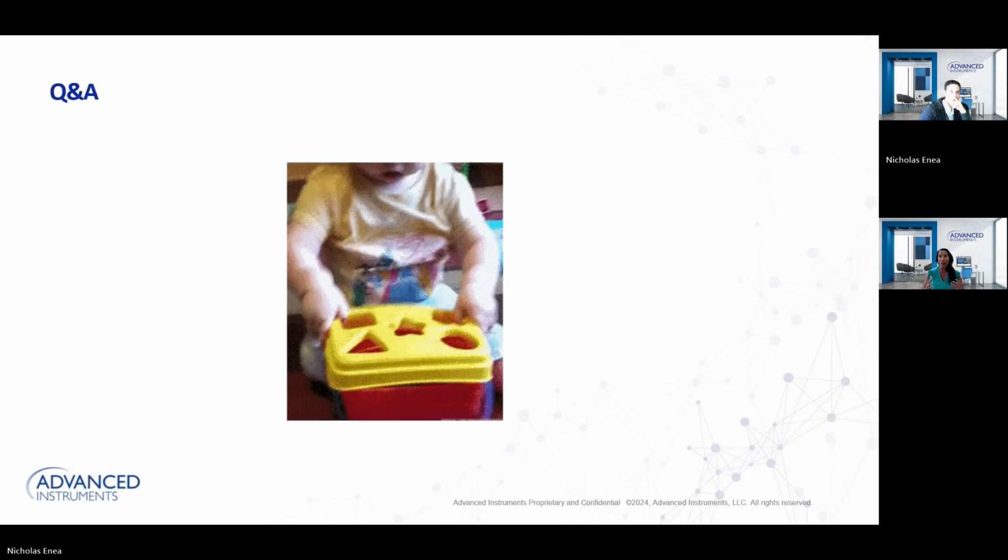When we think about how pipettes function, it's their tips and the pipette itself that makes your pipette system. So making sure that you're performing feasibility studies and really understanding how those tips are working with that pipette, and then also calibrating those pipettes with the tips that are being used on those devices, are all very important tasks to perform.